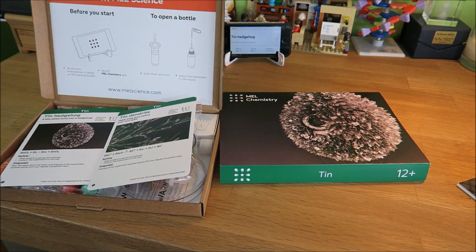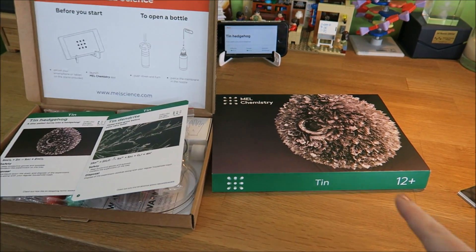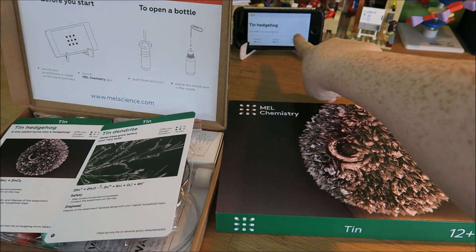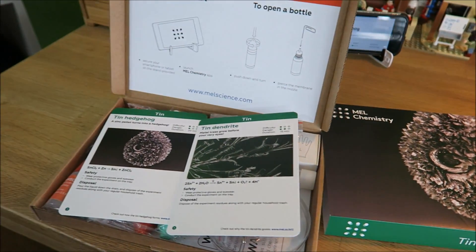We are starting off with the tin chemistry one. You see the pretty box, the iPhone stand with the app open so you see what to do.